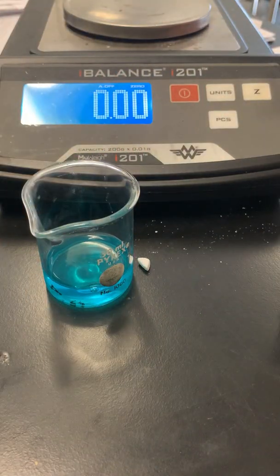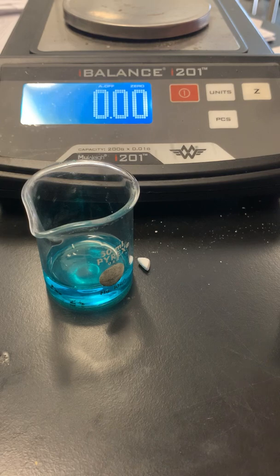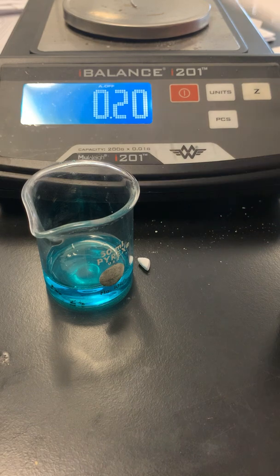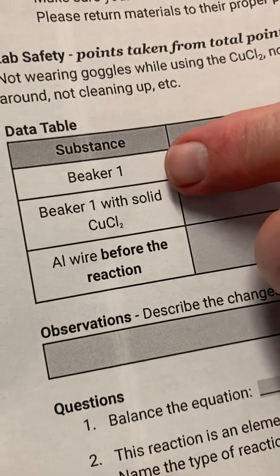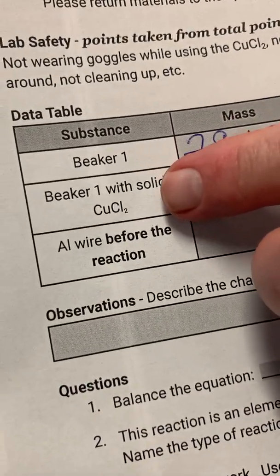So that's one of my reactants, copper chloride. The other one is aluminum. And so we have a bit of aluminum here. And that's 0.20. So my aluminum is 0.20. So on the data table in the lab, you have the beaker with the solid in it, right?